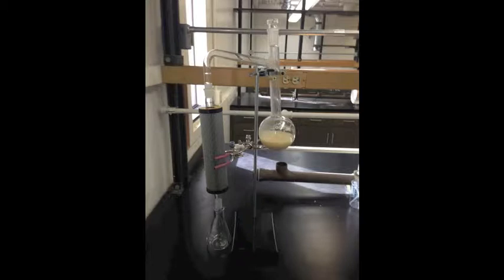Distillation is a method of purification in which a liquid is vaporized and successively condensed in order to separate its components. Distillation operates on the property of a substance's volatility, or its ease of vaporization. When a liquid is heated, the more volatile substances vaporize, leaving the less volatile substances behind. Thus, liquids containing substances with different levels of volatility can be easily separated by distillation. Ethanol is one such substance, capable of being purified from a fermentation broth to 95% purity.